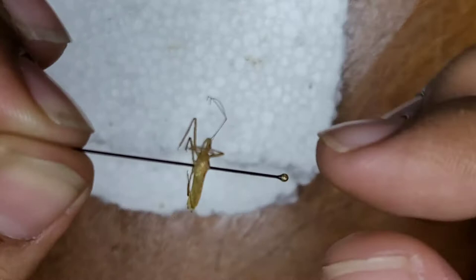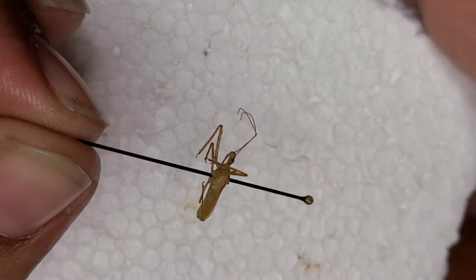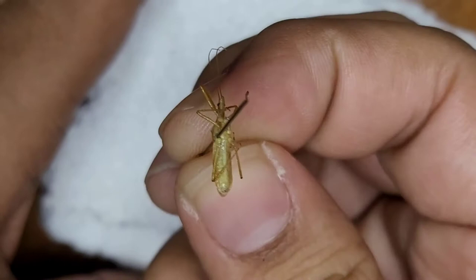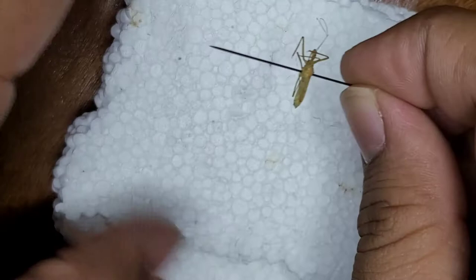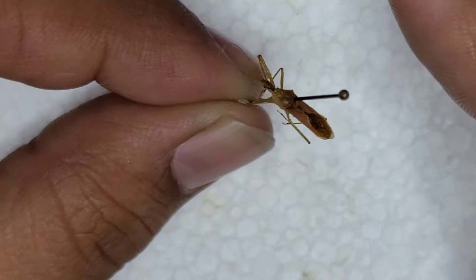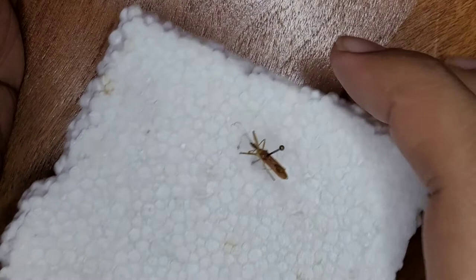I'll try to get this in focus and bring up the styrofoam. There's the bug in focus — you can really see a lot of the features, including that piercing beak right there. From underneath it's not the greatest pinning in the world — it came off a little too much to the right and not as straight as it could be, but it'll work.